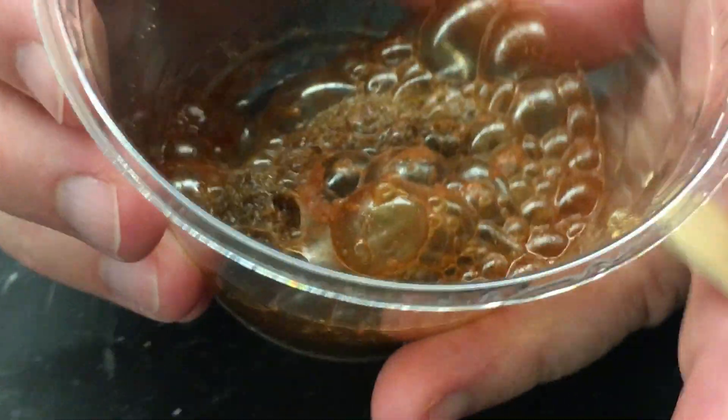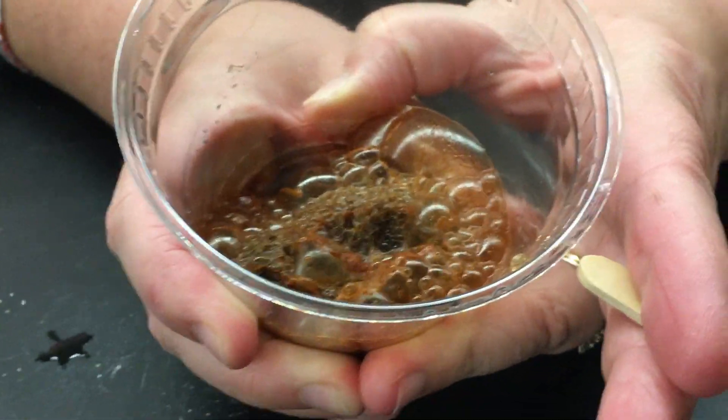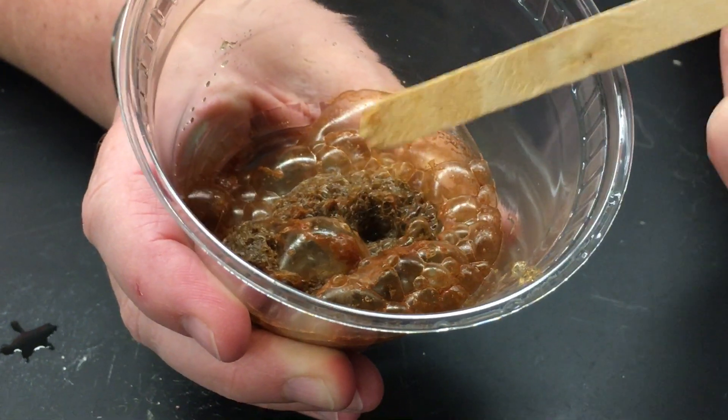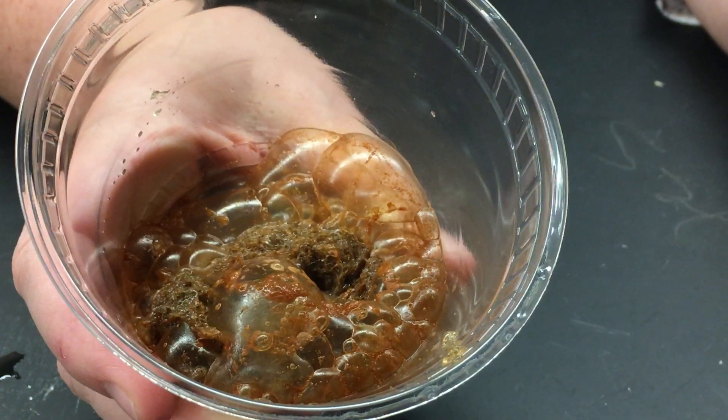And if I feel the outside of the cup, the cup is getting warm. I don't know if you saw that, but steam came out of that bubble after it popped. Look at that — that's really going.